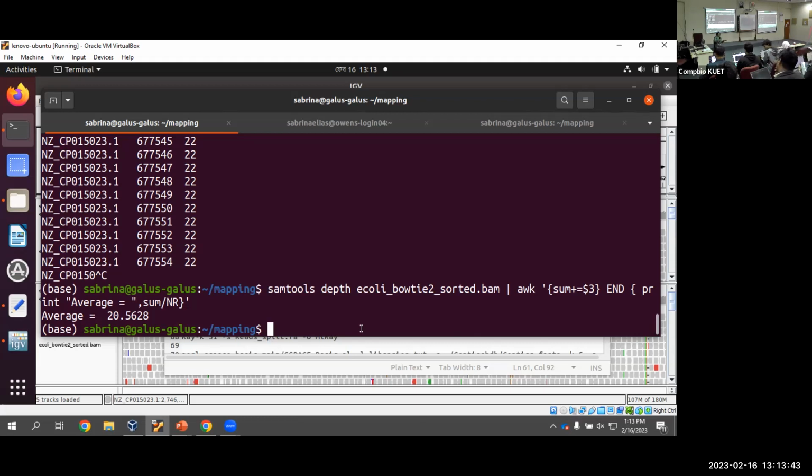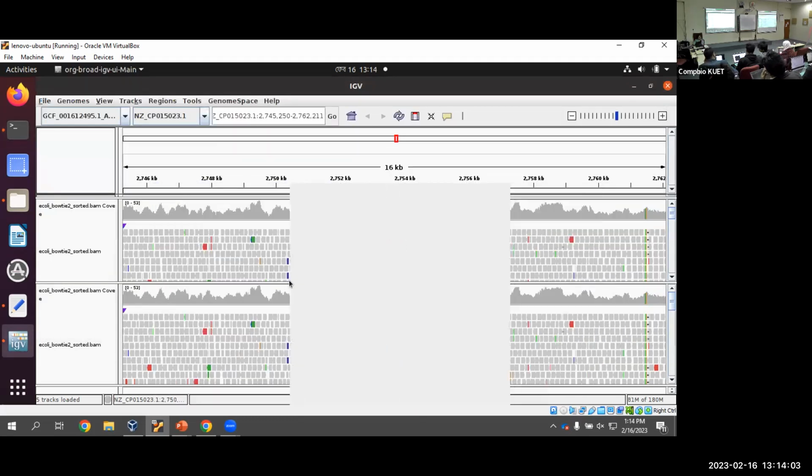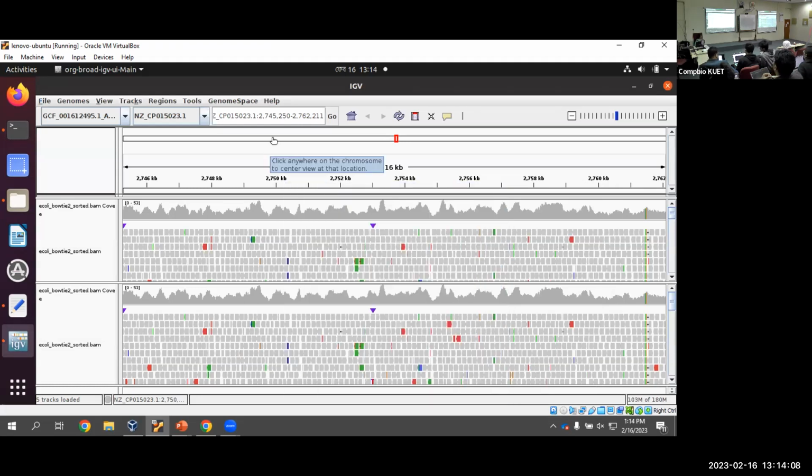And we need this. I mean, if you have a reference genome and you have a new species sequence, and there you have the reads, then you can align those reads and see whether there is variation. We will go to that later, but you can see here, if we find something like an insertion maybe here, which is not present in the reference genome but is present in our read, that's how we can compare the genome later.